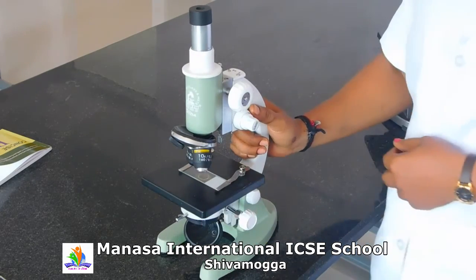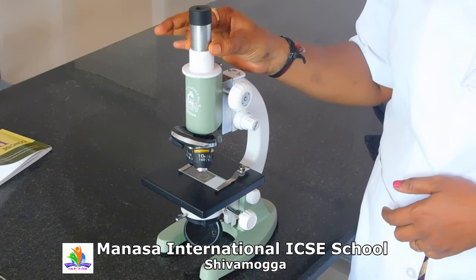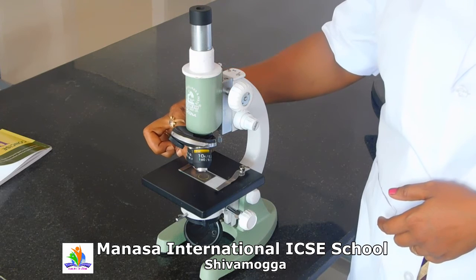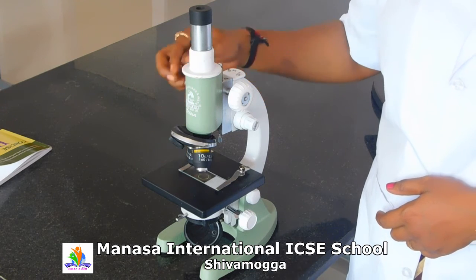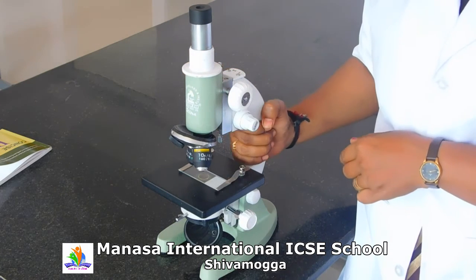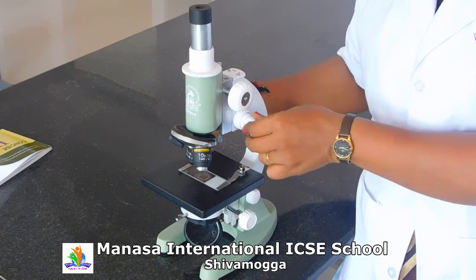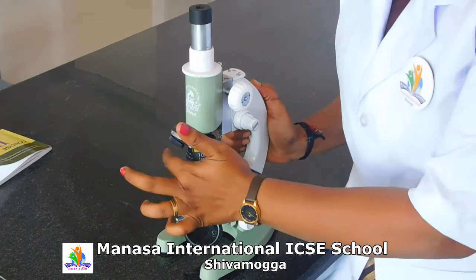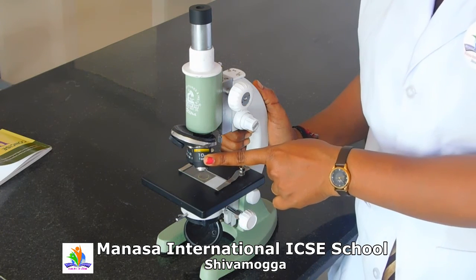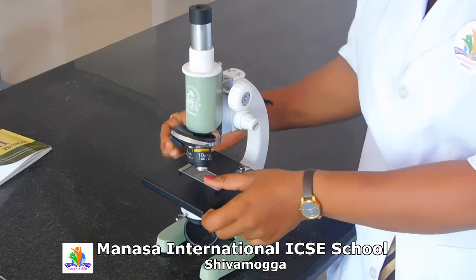Let me explain you once again. This is a compound microscope. We have the eyepiece through which you can view the material placed here on the slide. Clear? And this is the coarse adjustment. Okay. This is where you can handle it. Okay. This is the fine adjustment. We have two objective lenses, the higher objective lens and the lower objective lens. This is the slide. Okay.